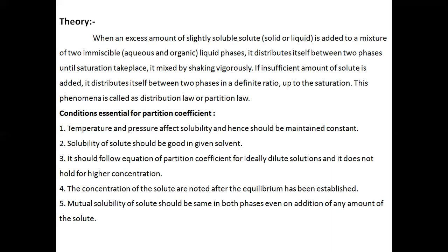Conditions essential for partition coefficient are temperature and pressure affect solubility and hence should be maintained constant. Solubility of solute should be good in given solvent. It should follow equation of partition coefficient for ideally dilute solutions and it does not hold for higher concentration. The concentration of the solute are noted after the equilibrium has been established. Mutual solubility of solute should be same in both phases even on addition of any amount of the solute.